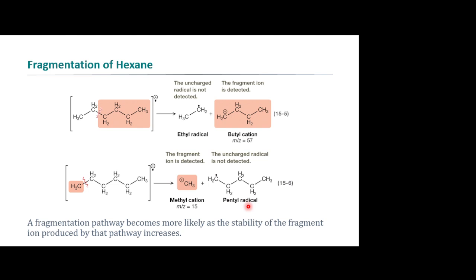All right, so remember that whenever we draw these out and whenever we talk about these, is this ever detected? The free radical neutral? No. No, we ignore that, right? Who cares? Go away. Okay? Because this is neutral. It's just not going to bend. It's going to slam into the wall and get pumped off, right? So that's going to go away. The only one that can make that turn because of the magnetic field that's involved is something with a charge on it, right? Specifically a positive charge. And so only these ones with the positive charge on them can make that turn.